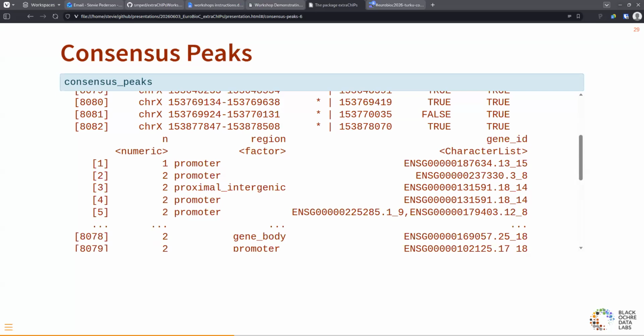Yeah, because promoters can be downstream from the TSS. Say you say 200, and for most of the genes it's fine, but for 10% or 5% it's going to be over. Yeah, I know. There's no perfect solution. I think you could actually define those promoters by going to the FANTOM5 project or something along those lines and try to get better promoter representations. Yes, absolutely. But all we've got is ChIP-Seq and a GTF. What's our best strategy? But yeah, you can source all of that information if you'd like.